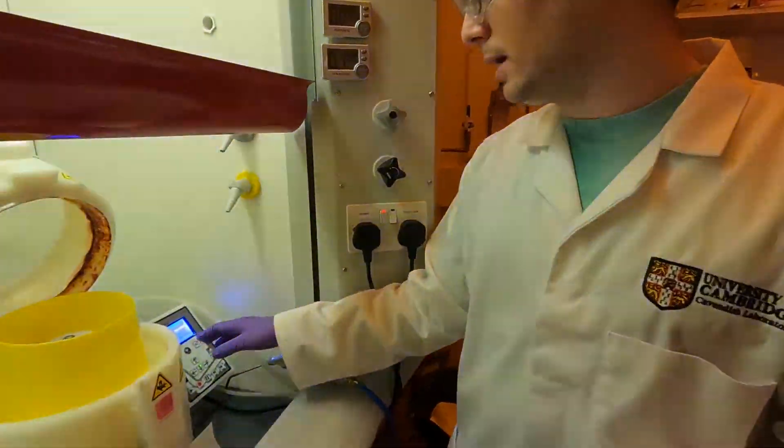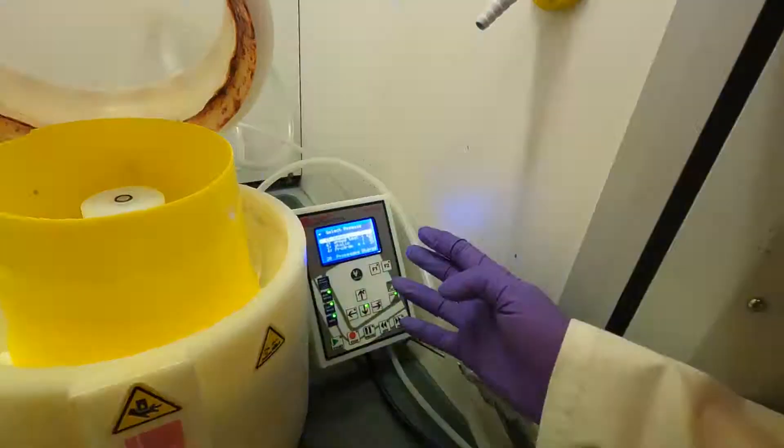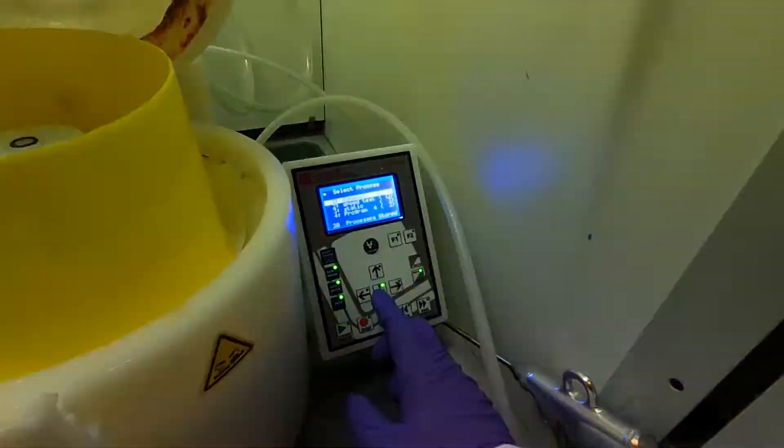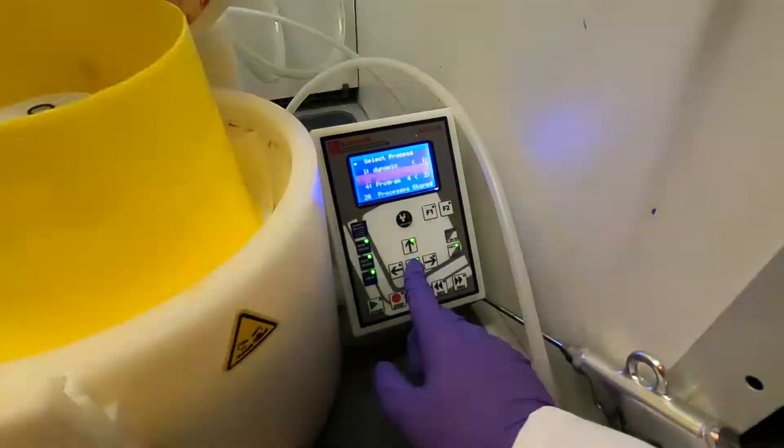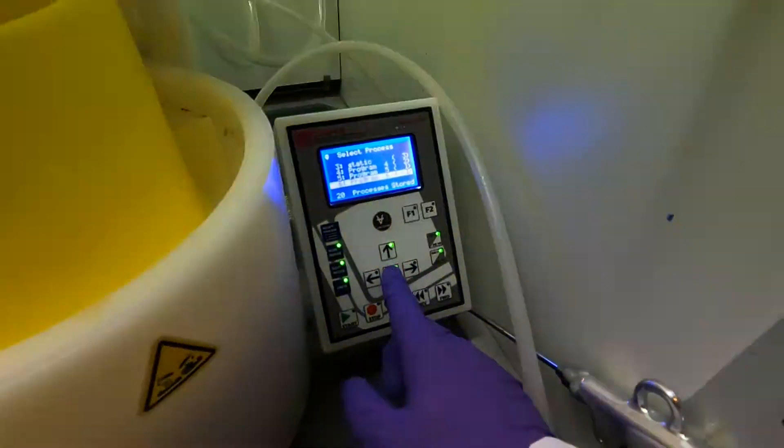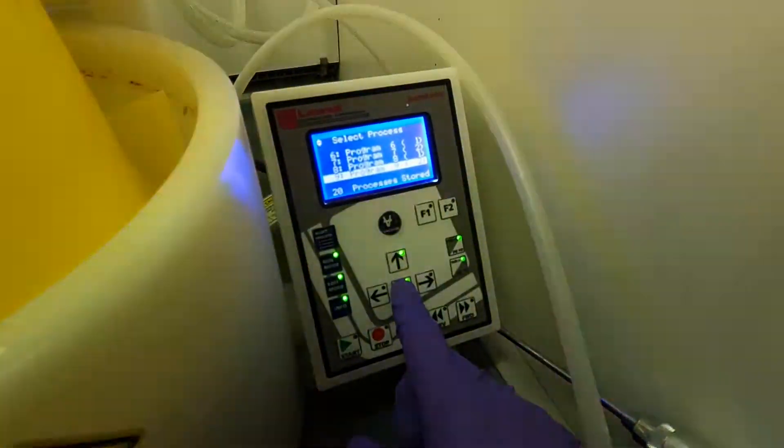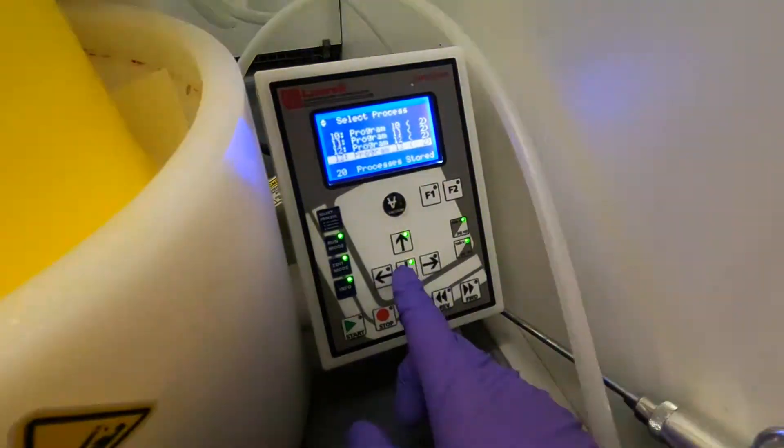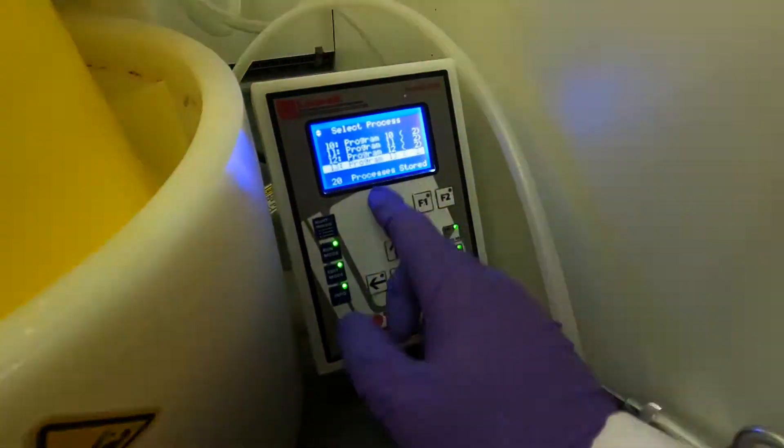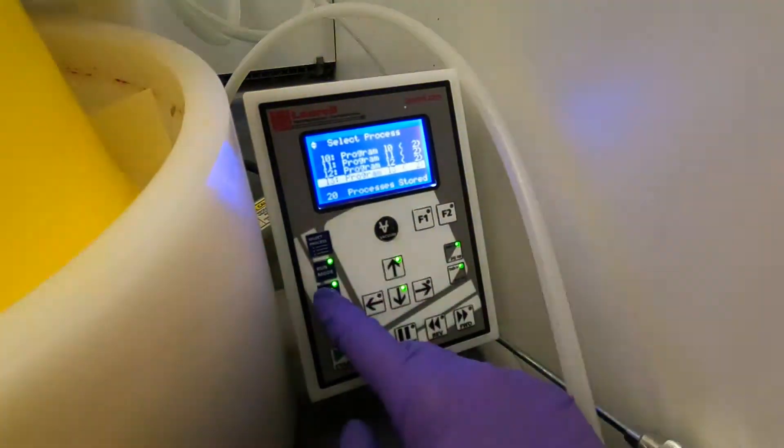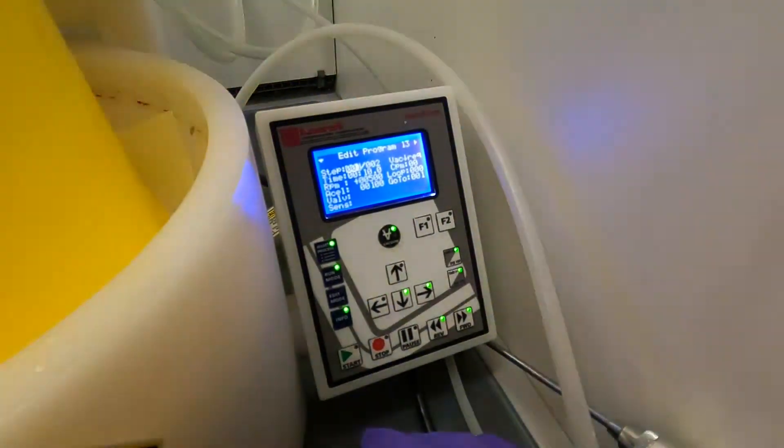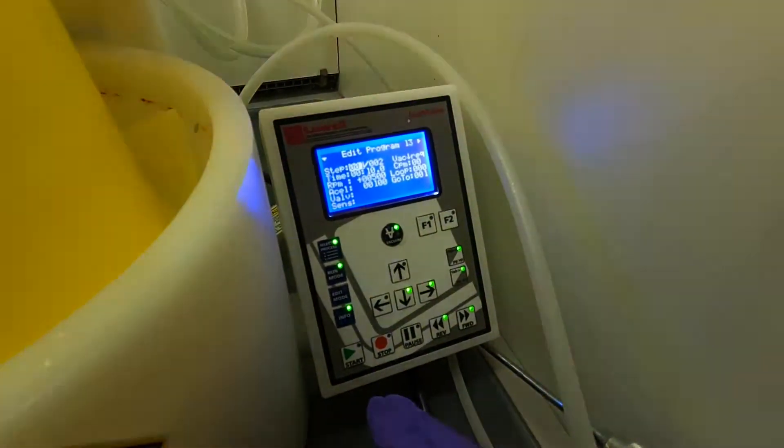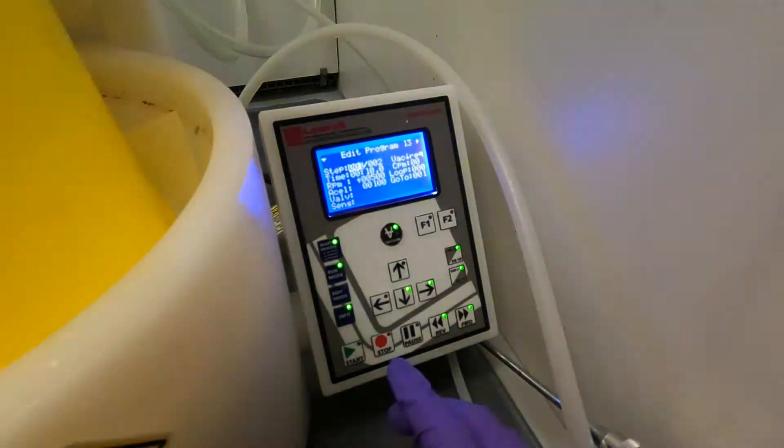I've turned on the spinner and you can have a look at the display. This is the display when it's first turned on. What I want to do now is to scroll through the programs, and the program that I will use today for this demonstration is program number 13. Once you select program number 13, I can hit the edit mode button and this will allow me to change any values or to just check the values to see that I have what I want.